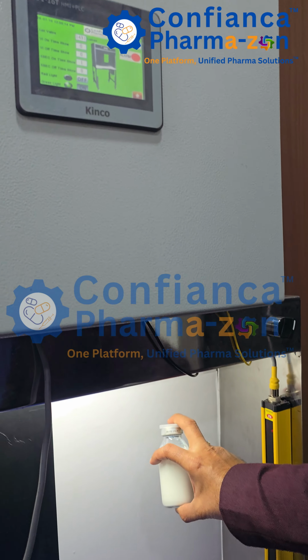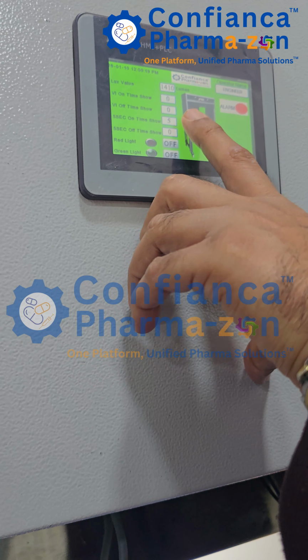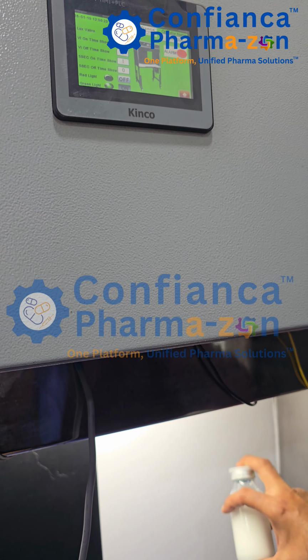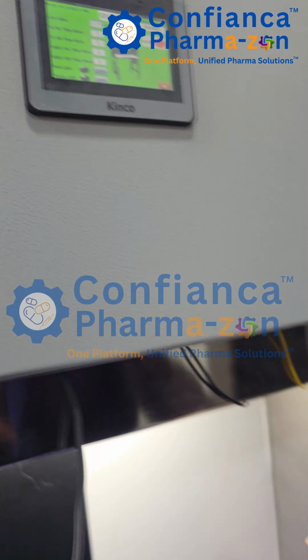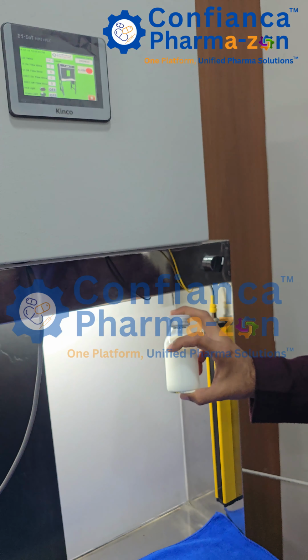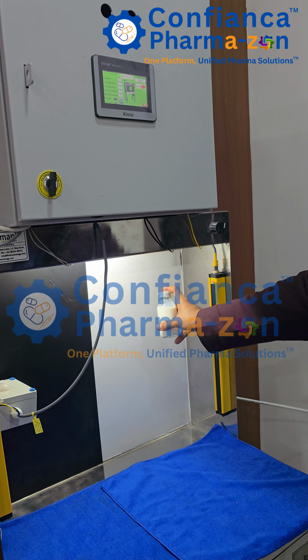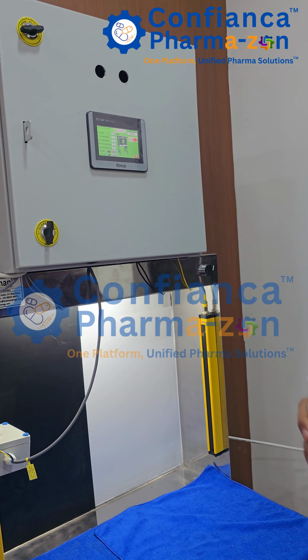If I put my hand in, you can see the on indication come up and the 5-second timer is running. When I remove my hand, the timer will stop. If I put it in again, the 5-second timer will run. So you can see both things: when I put my hand in, the timer is running, and when I remove my hand, the timer goes off.